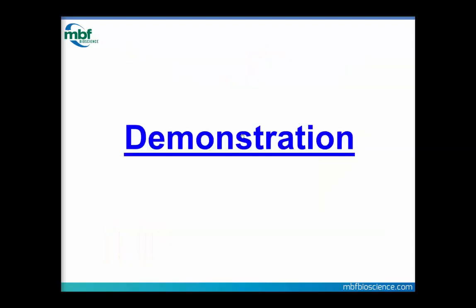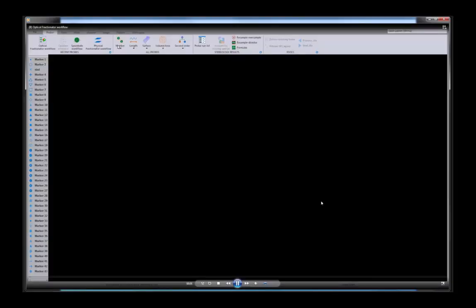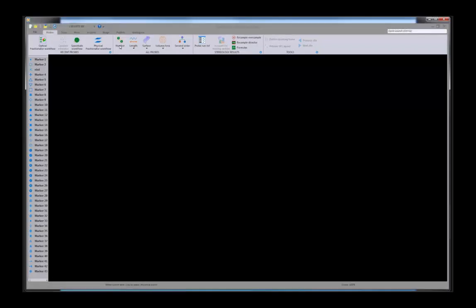This is a pre-recorded demonstration, and here is our software, Stereo Investigator 2017. The probes are organized by what they do: number, length, surface, volume. Relationship among particles is called second order stereology. I'm going to go to the workspace tab and get some useful dialog boxes.